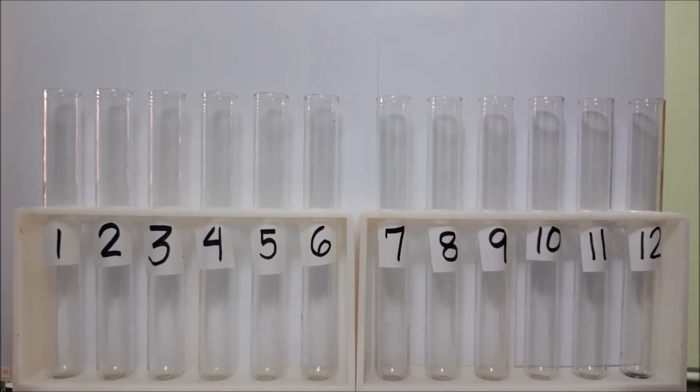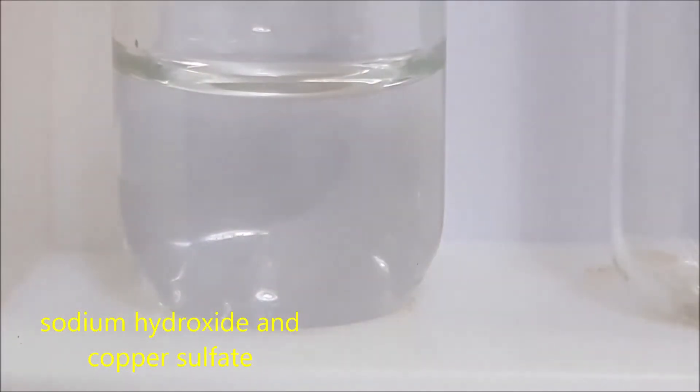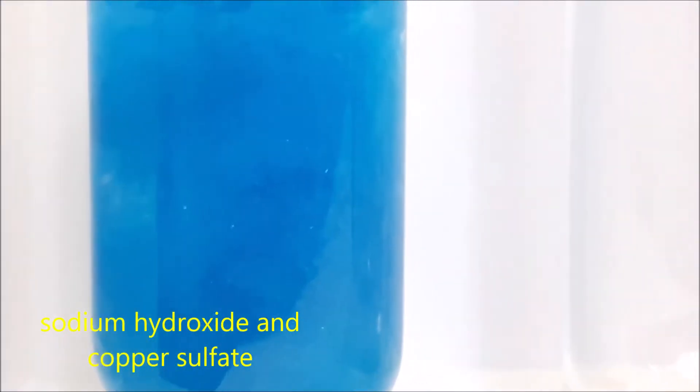For test tube number one, I will put sodium hydroxide and we will add it with copper sulfate.